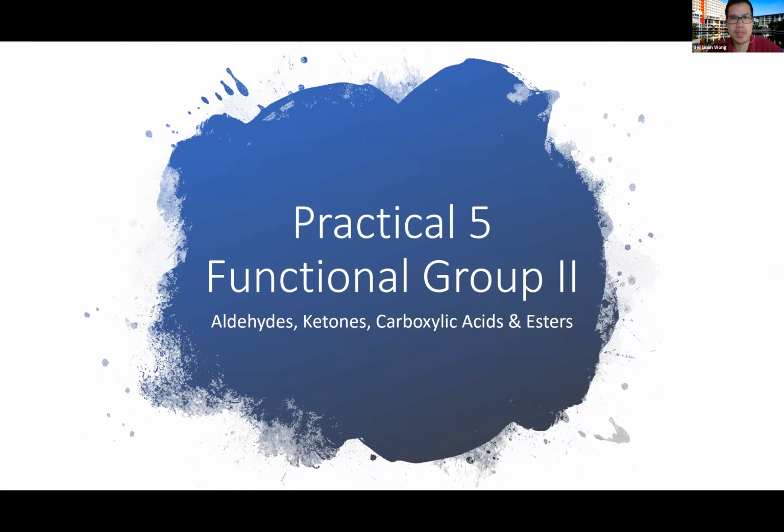And you'll be seeing that in these practicals, some of the chemicals, the procedures, the methods that we use to test the functional groups are similar. Later you'll see that we'll be using the chromic acid tests and also iodoforms, because these are some of the tests that are similar in terms of how they react with the groups. I'm going to explain later on.